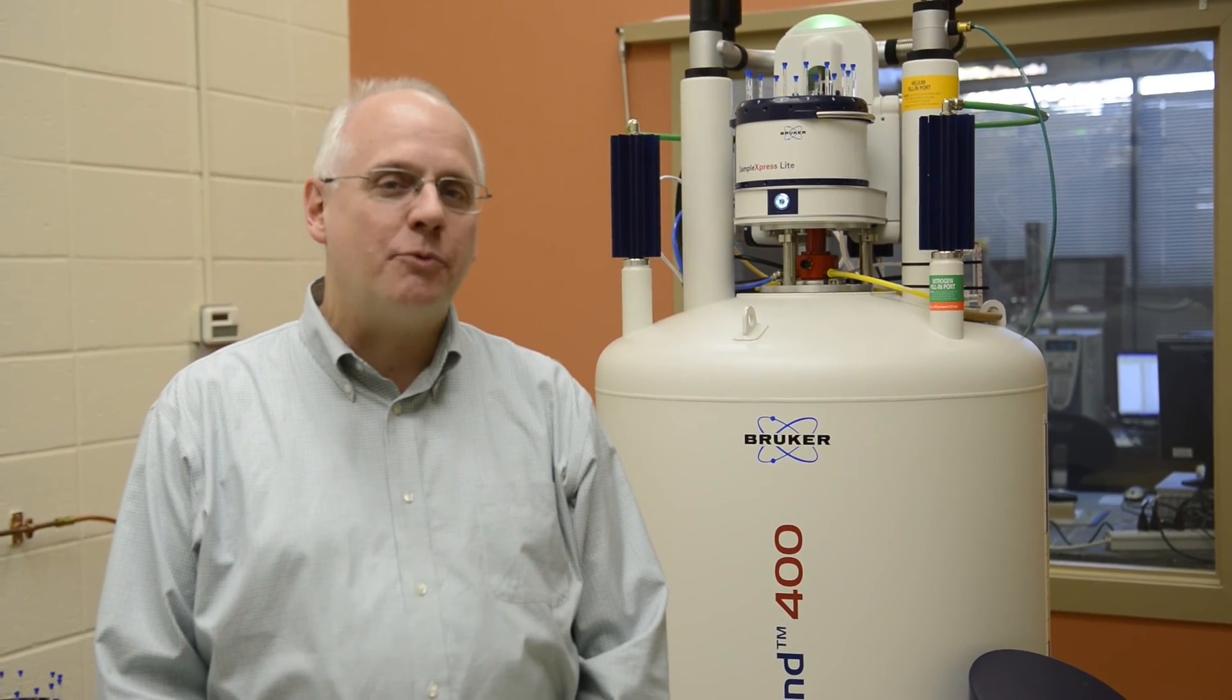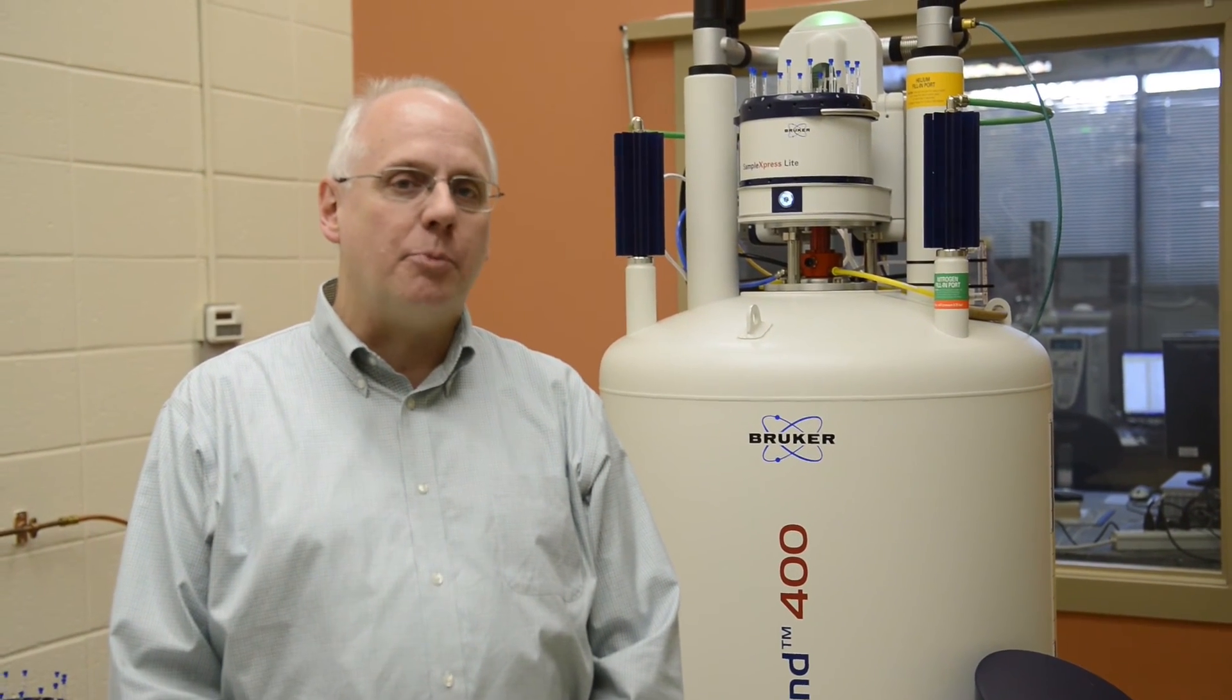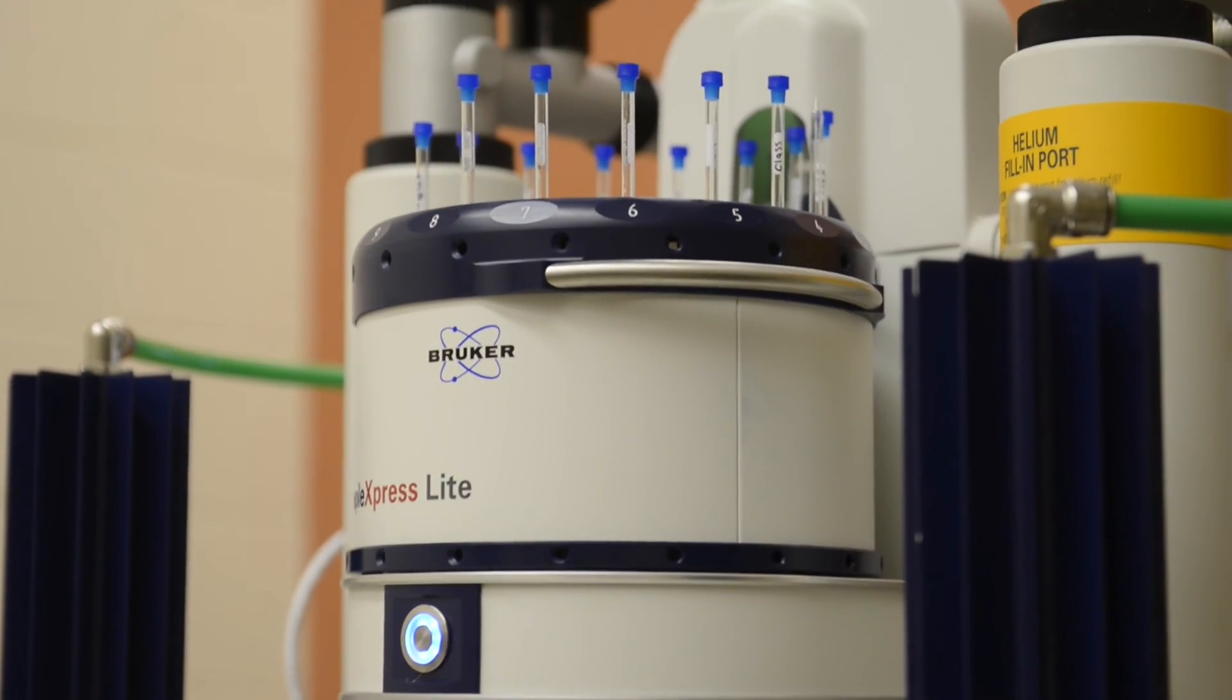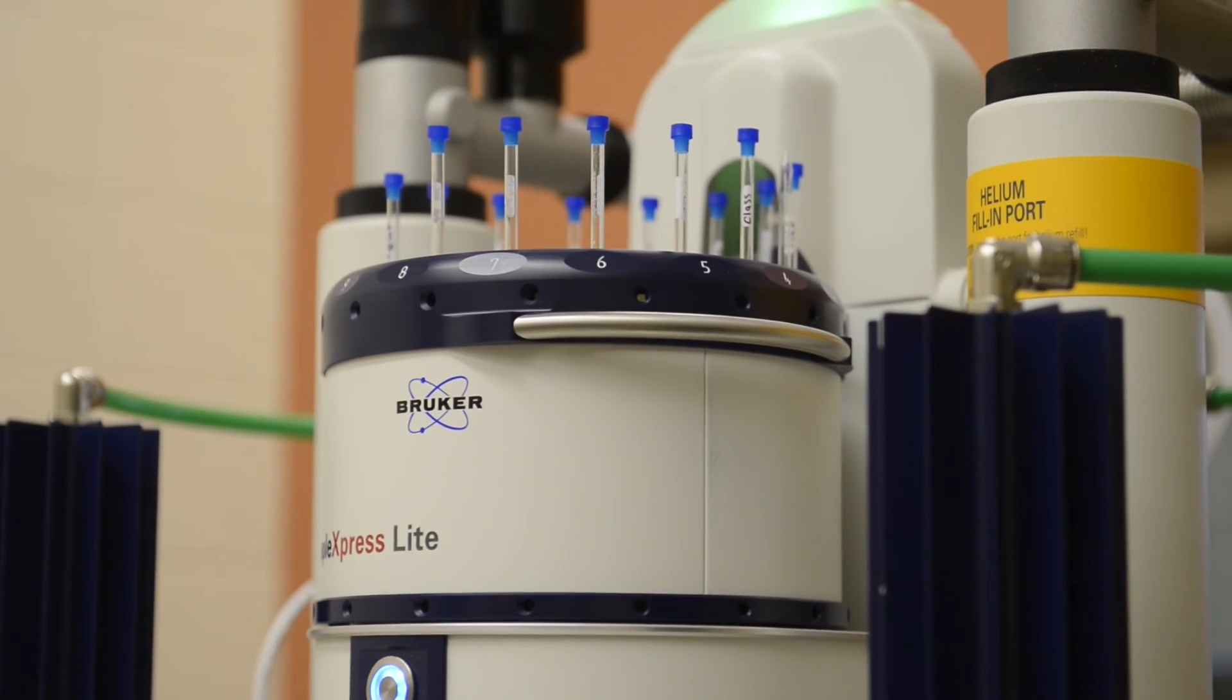I'm Curtis Pulliam, professor of chemistry and chair of the Department of Chemistry and Biochemistry. Today we're here in the instrument laboratory at Utica College, and behind me is our newest acquisition.